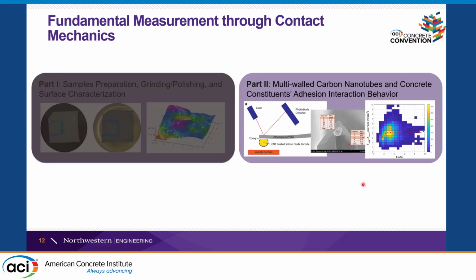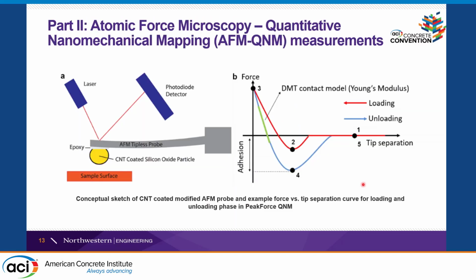So that's more on the sample preparation for doing the adhesion test. In the adhesion test part, we developed a multi-wall carbon nanotube tip that will acquire adhesion forces. So this is a schematic. Here we have a silicon oxide particle that is coated with oxidized multi-wall carbon nanotubes and is glued to a tipless AFM cantilever with epoxy.